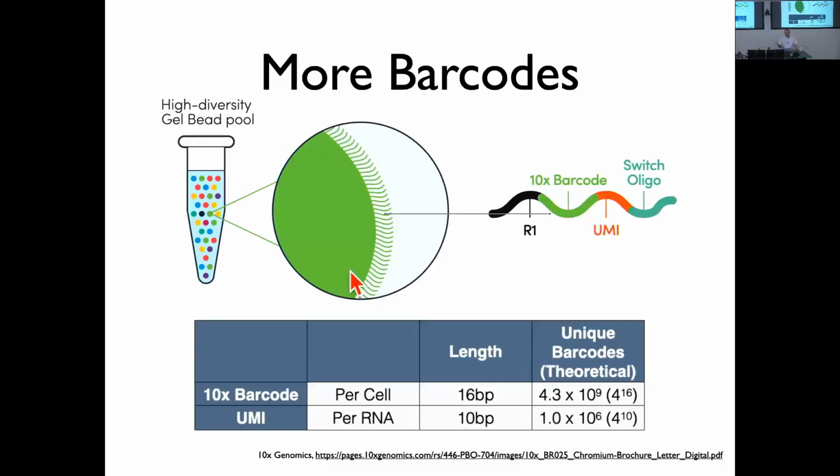And then for the UMI, I told you the UMI is easy, but basically you take it all together and now you have all your beads. You don't care what goes on anything. So you just throw ATP, CTP, GTP, TTP all in there. And I skipped a step. Somewhere in there, you have to take off the terminator so you can add the next step.